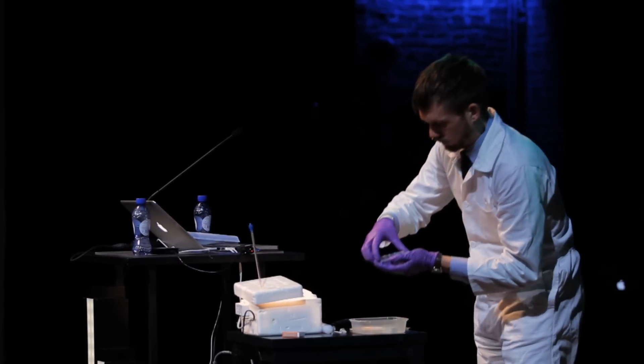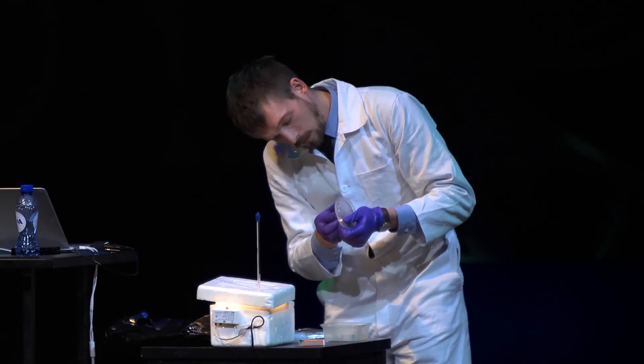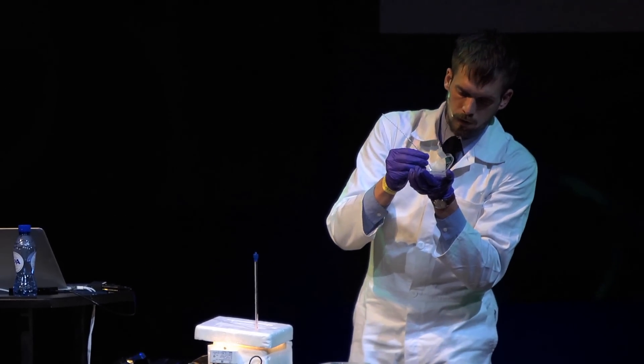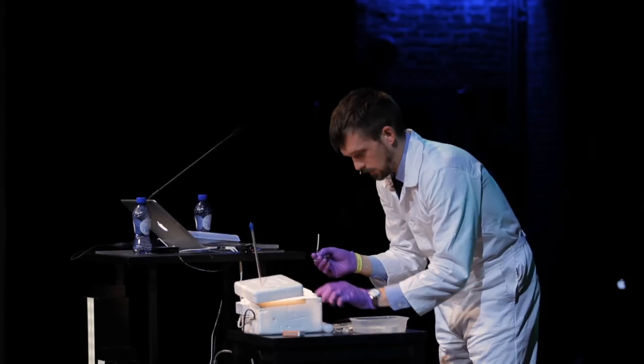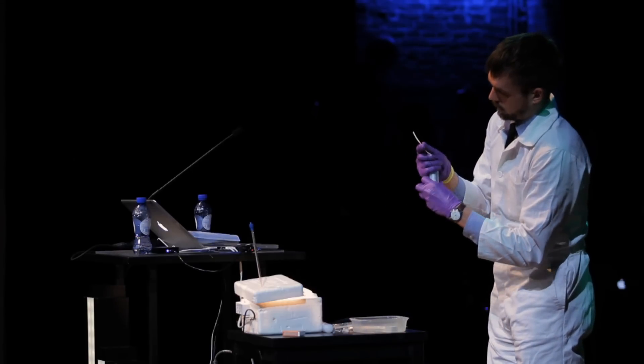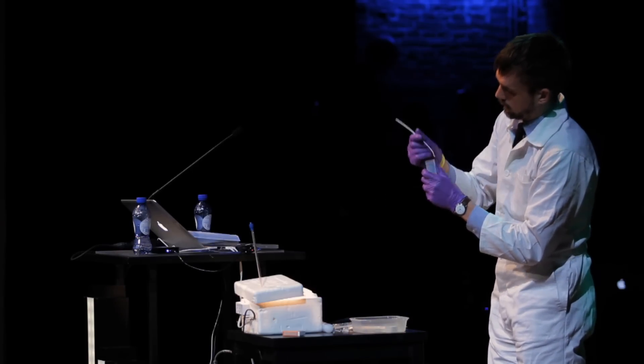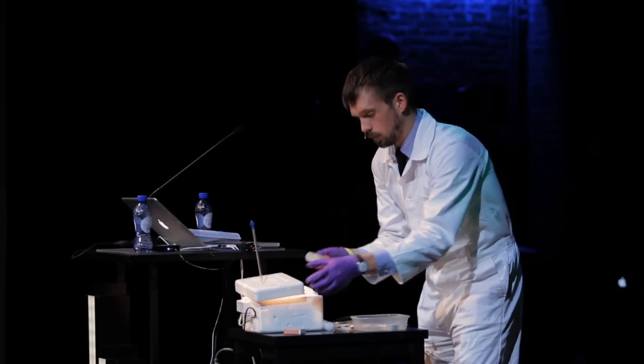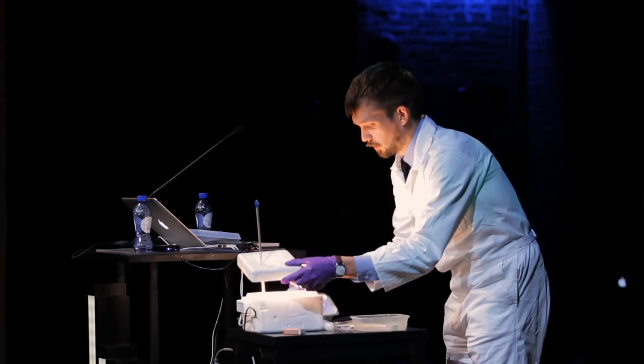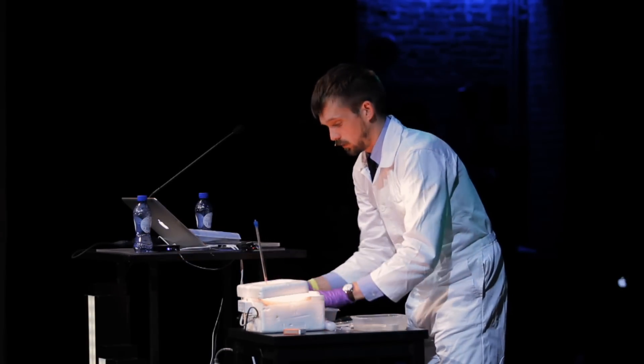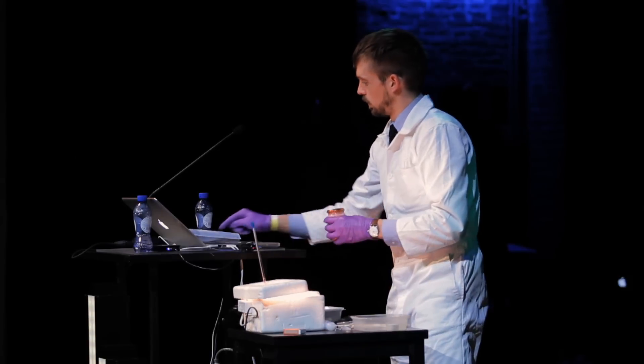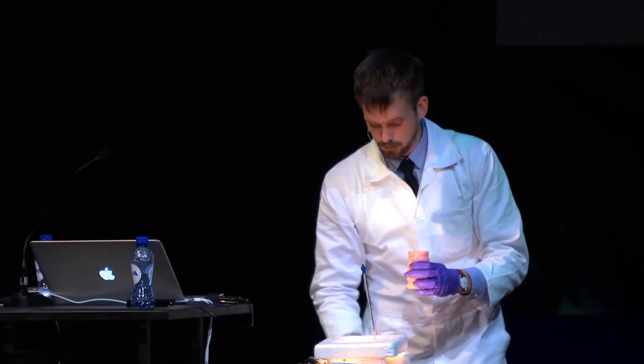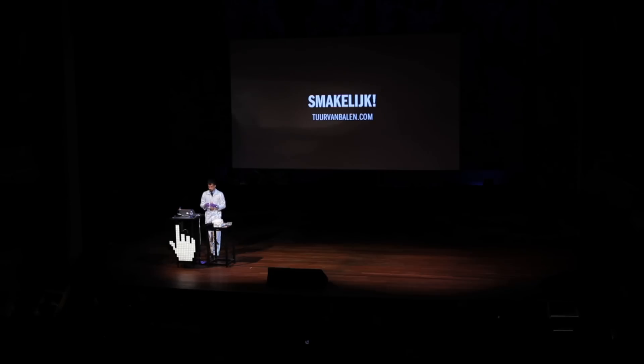There we go. And now you can see that the bacteria have kind of grown on there. You can't see it, probably. I'll tape it close. I'll be quick, because I'm running over time. You harvest the bacteria, so you take a clean loop. You take one of these cells, and you grow them again on the last pot of medium. And this basically will be your bacteria you make your yogurt of. This will be a starting culture for your yogurt. Basically, that happens as you normally make yogurt. You just add milk to it, and the bacteria will transform into yogurt overnight. And now, here is one I've done earlier. And I believe you've all received one as well, so you can all taste it. Smakelijk. Thank you very much.